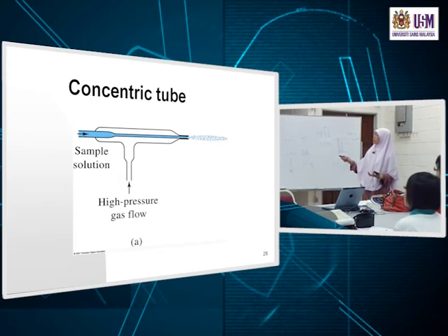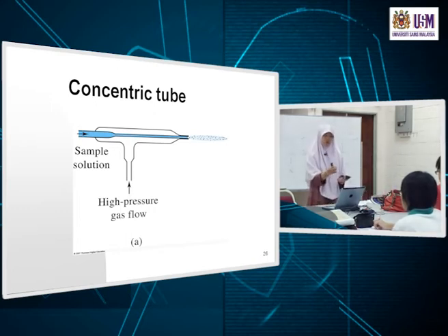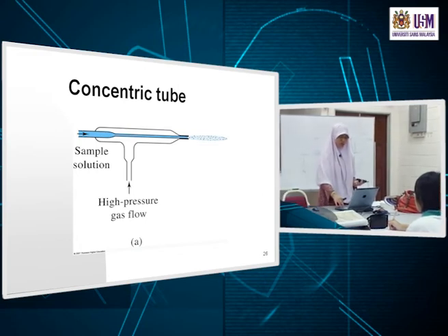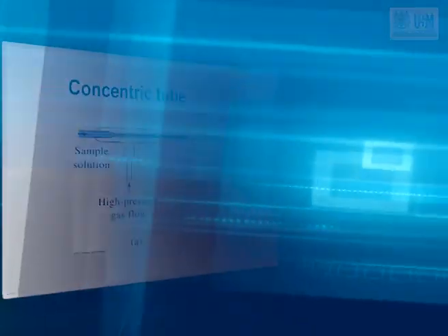So you form some low pressure region here, which will then make the atmospheric pressure push on your container here, push on the sample, and the sample will again go through here. And as it goes through that low pressure region, you get your aerosol being formed. So most of the nebulizers used are based on this. And then you have your other stories, which we'll look at much later anyway.